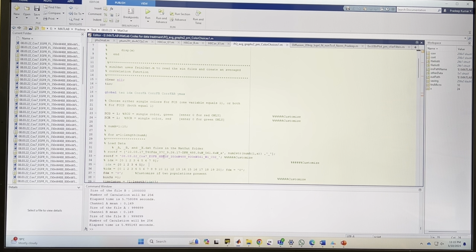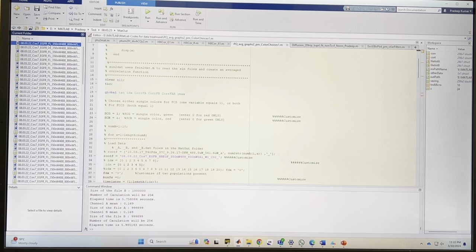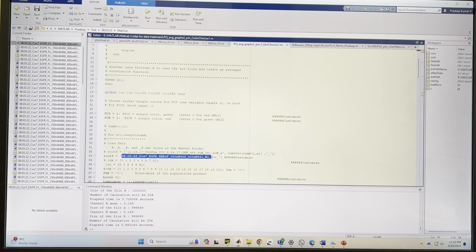This is the file path name, file root, so I know which one. I'll go here, select this one, and rename it, because the directory won't let me copy in MATLAB. So copy, and then I can put this name here and paste, and then you have to remove this backslash A. We have to go here till CO1, so cell number 1, and then for cell number 1, you can either press the F5 key or the start run.